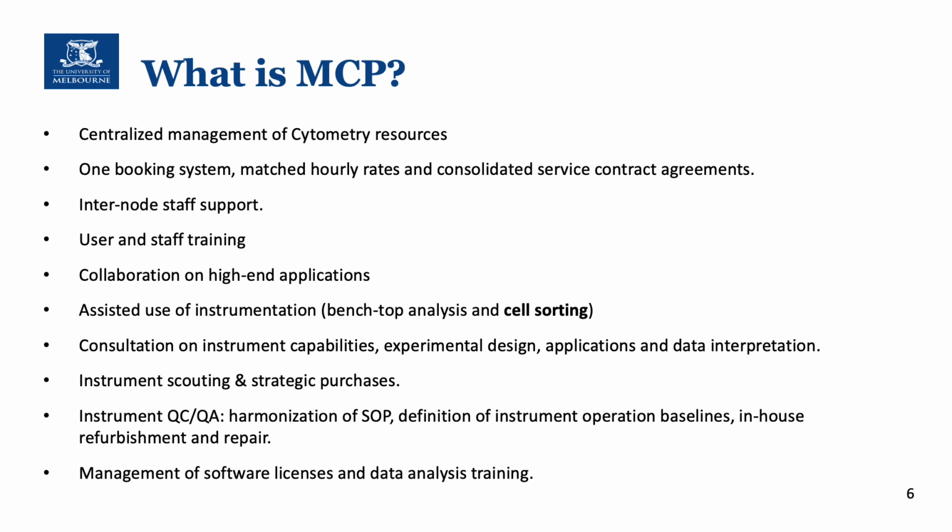The platform staff can assist the use of instrumentation, specifically when users are starting or if they are doing cell sorting. These are applications and services that are mostly all the time provided by a staff member. But most of the instruments that we have can be, after induction and training, used directly by the users without any supervision.